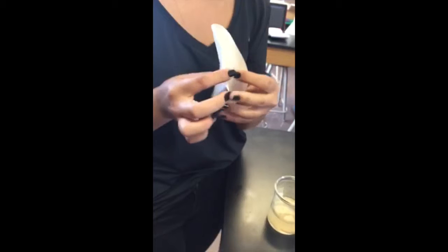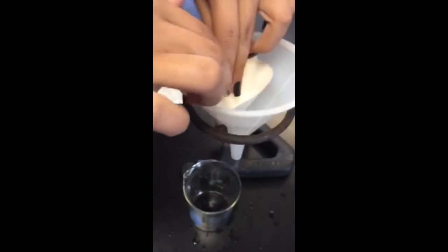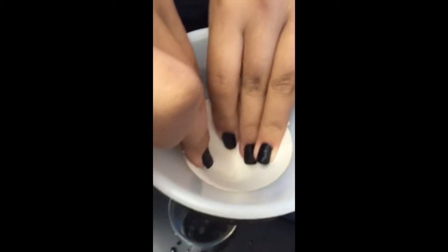Then I am folding my filter paper in half and then once again into a quarter. I place this paper inside the funnel and make sure I have a beaker beneath the funnel to catch the water.